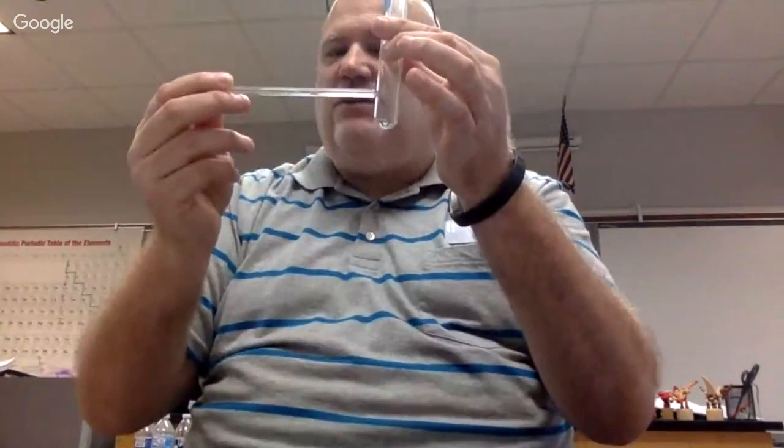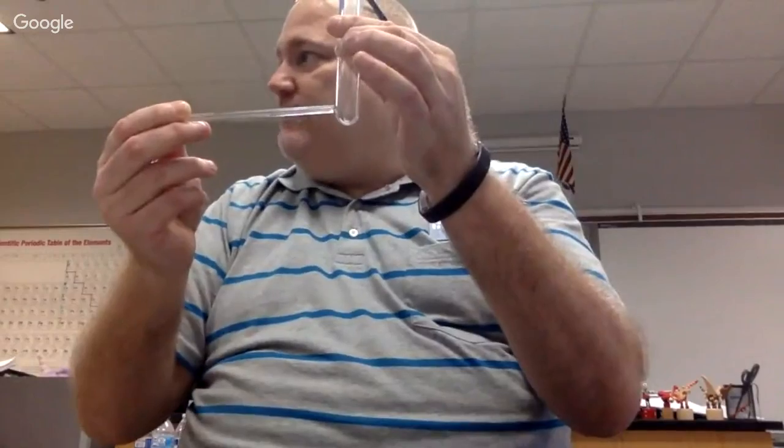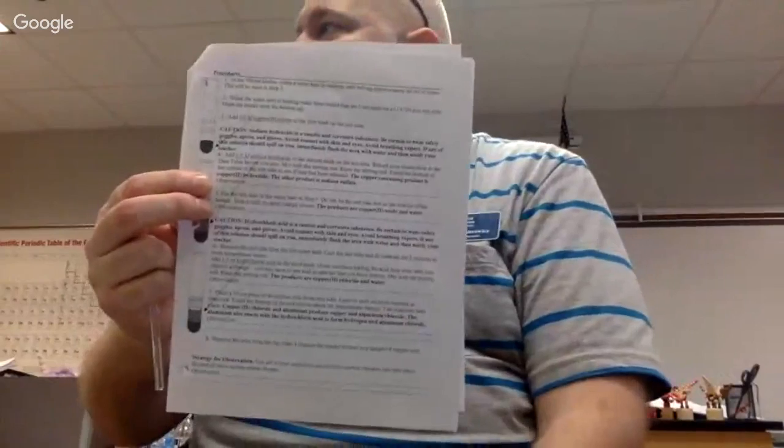Then what you're going to do is take a glass stirring rod. Can you pass me a glass stirring rod there? Okay. This glass stirring rod right here. And what you're going to do is stir the two things together, because when they start reacting, some of the stuff on the top will not react with the stuff on the bottom. So you'll stir it in, and then if you take a look in your notes, underneath each of the steps, you see under step 4, it says observation. You're going to describe what it looks like after you've stirred in the section here.